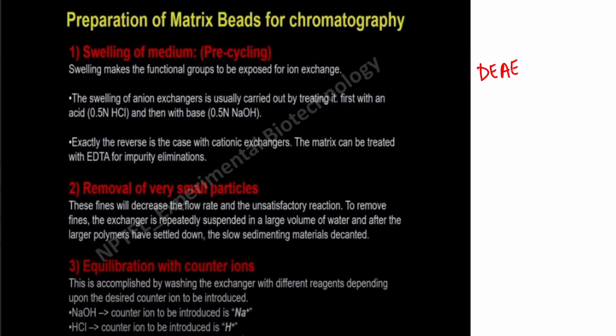If you see the structure of DEAE, it is just diethyl aminoethyl, but this diethyl aminoethyl is either added to a cellulose or a dextran. So, any type of sugar or carbohydrate kind of medium. These mediums are basically insoluble in water, and that's how we can make a stationary phase out of these mediums.